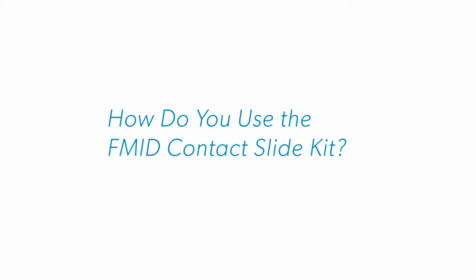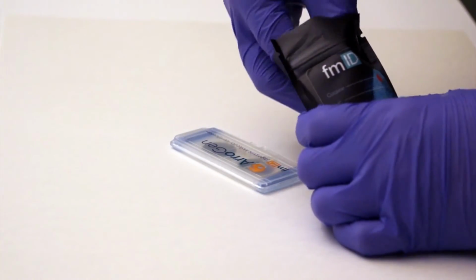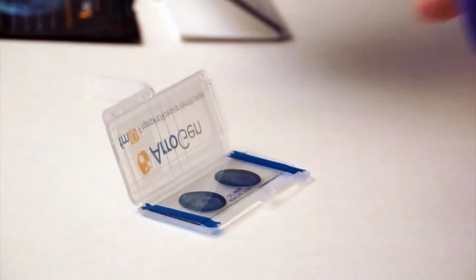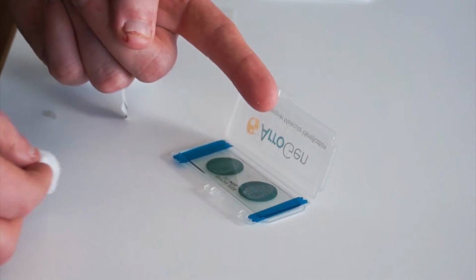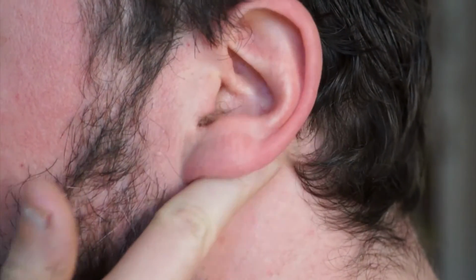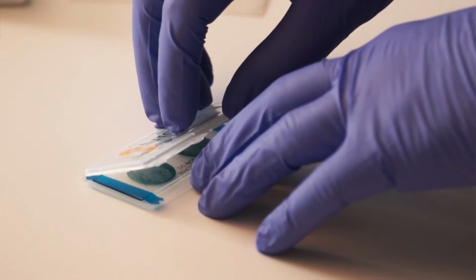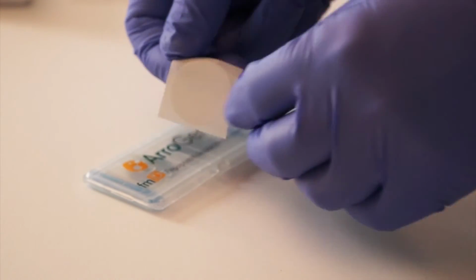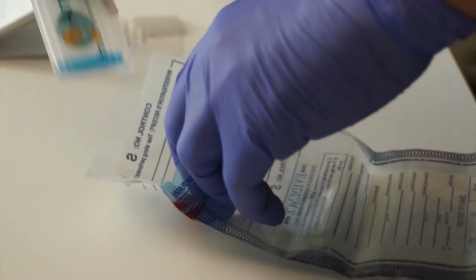How do you use the FMID contact slide kit? You simply open the slide case and guide the person's dominant finger onto the slide to deposit residue on the left circle. Then wipe the finger with the included alcohol wipe and have the person rub their finger behind their ear for 5 seconds. Then guide that finger to the second circle on the slide to the right. Close the slide case, seal with the included sticker, and seal in an evidence bag or mailer using your standard procedures.